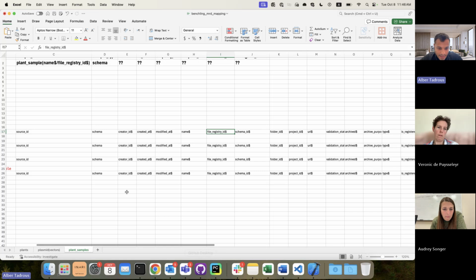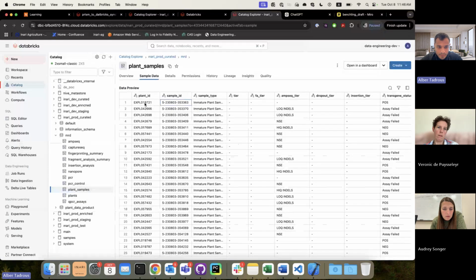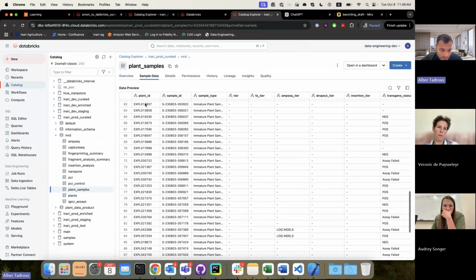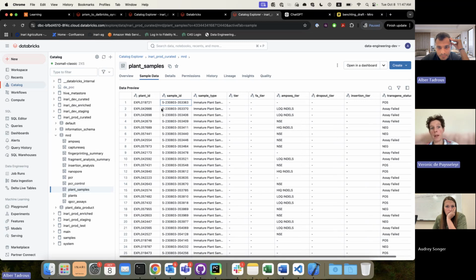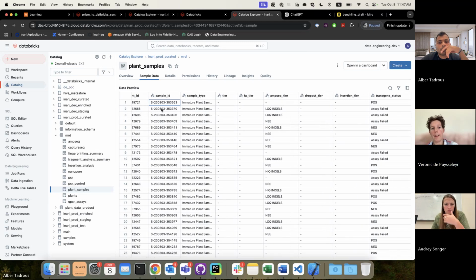Yeah, so as you see, in plant sample we refer to both immature and mature plant. But then, with plant ID, in some cases if you have the protoplast there, the protoplast sample identifier should be the second column, and then in theory, in the plant ID column, you should have the plant experimental condition. So then the plant is at the same level as the protoplast experiment, eh?